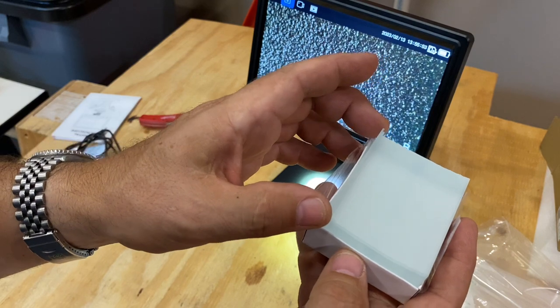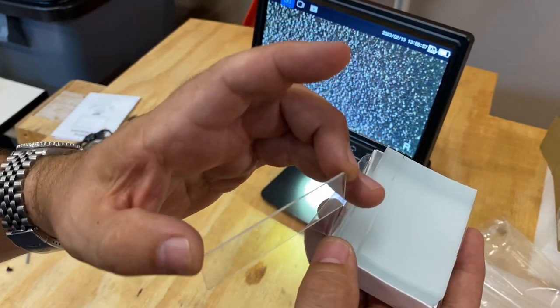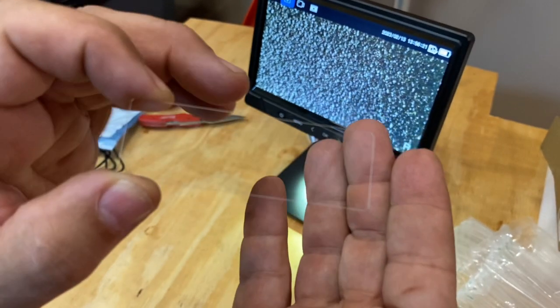Just slide one out like this. You can see that the corners are cut at a 45 degree so they're not too sharp, and they're just very well engineered.